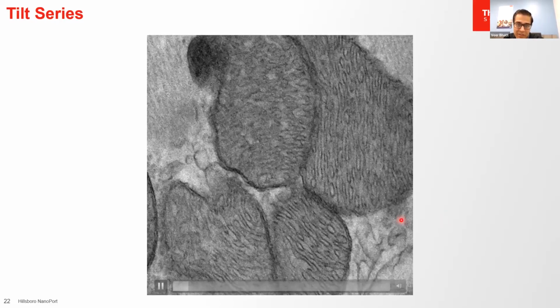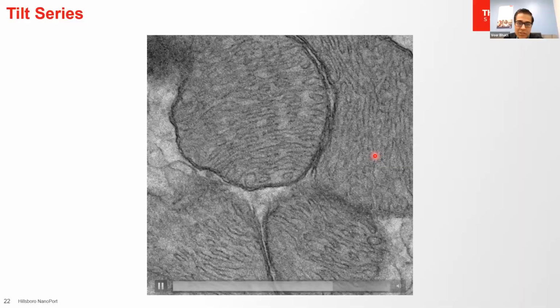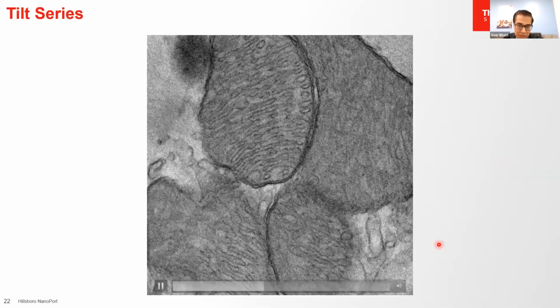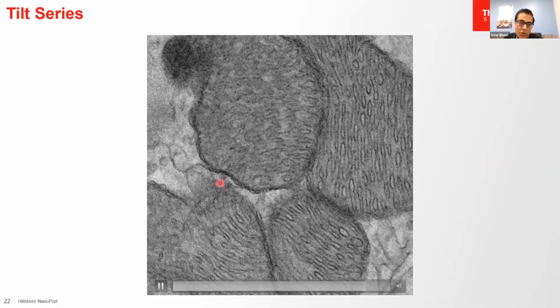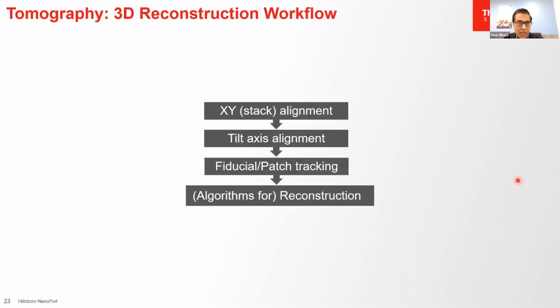The second thing is that our signal, our features look similar on both sides of the tilt, negative and positive. And what that means is that the optimized position is calculated properly, and that the focus is happening where it ought to happen, which is near the center of the field of view.